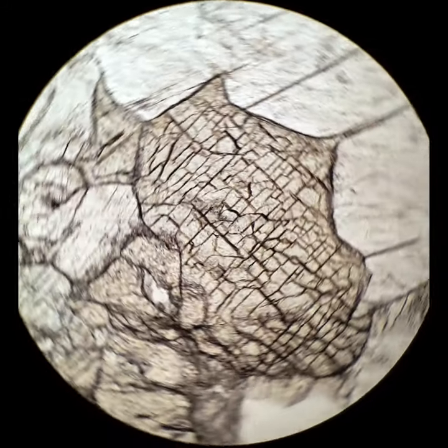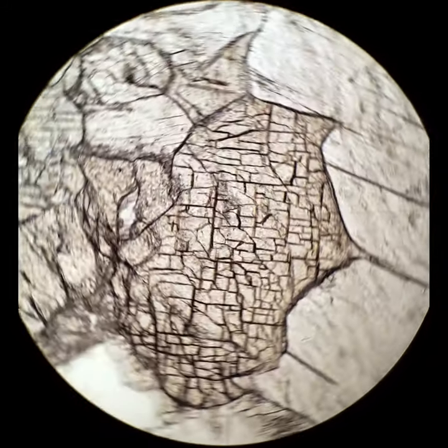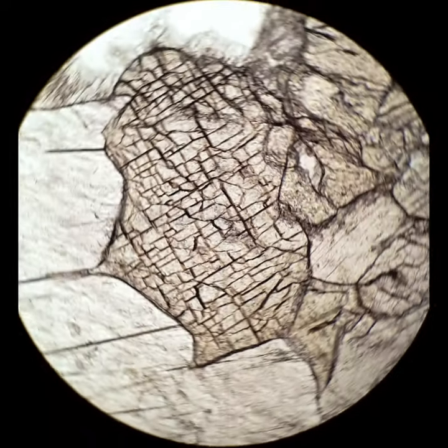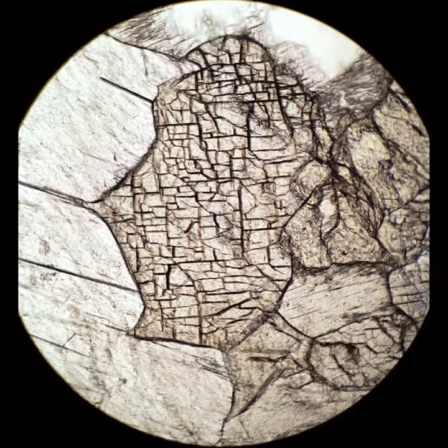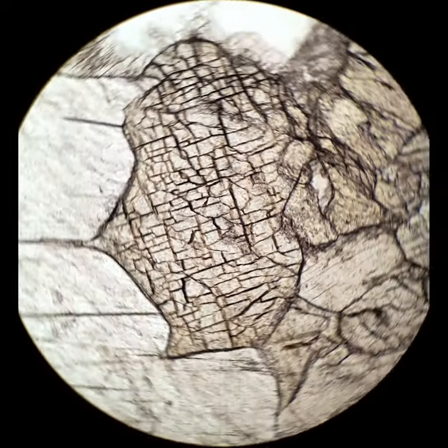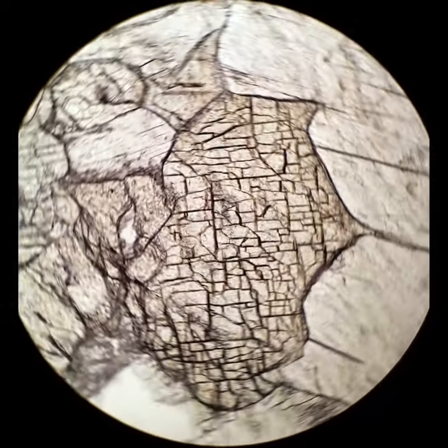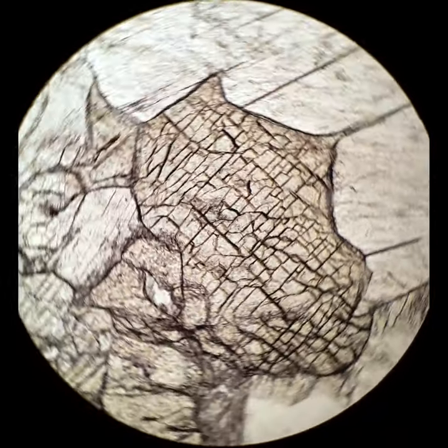Clinopyroxenes have cleavages that are oriented approximately perpendicular to each other, or 90 degrees apart. This is an end section of clinopyroxene showing those cleavages. They're not as well developed as in an amphibole.